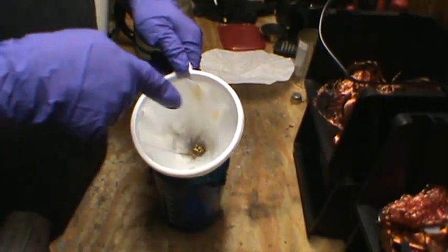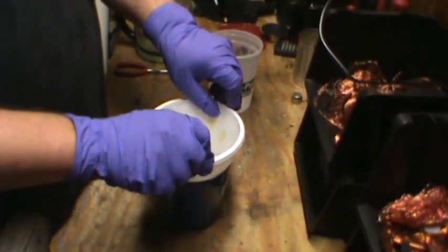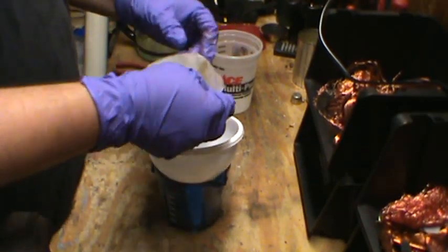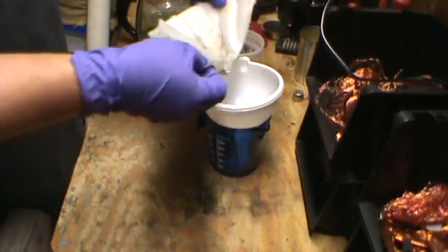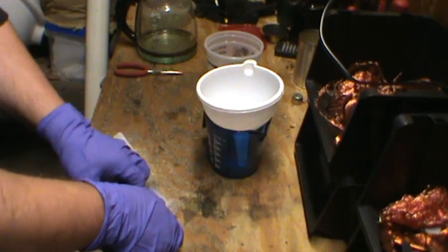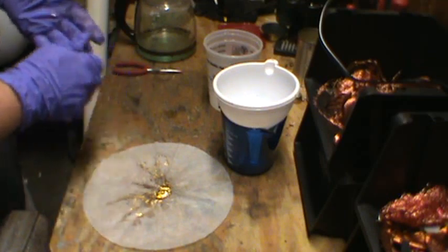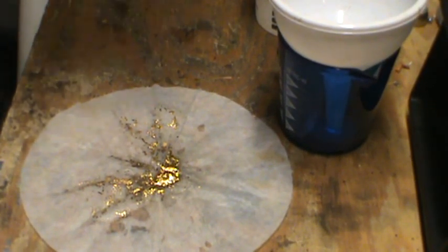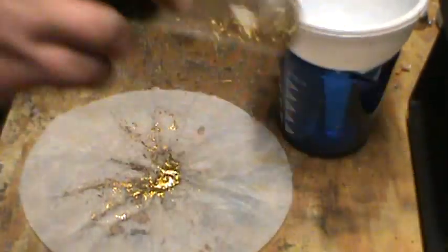I was just spraying all the gold foils off the sides of the filter paper. So from that handful of fingerboards that we put in there, we come up with a little bit of gold. Take a look — there it is, all your gold foils. Once you've rinsed all these and the water comes out clear each time, you can just let them air dry, then brush them to the middle and add them to the rest.